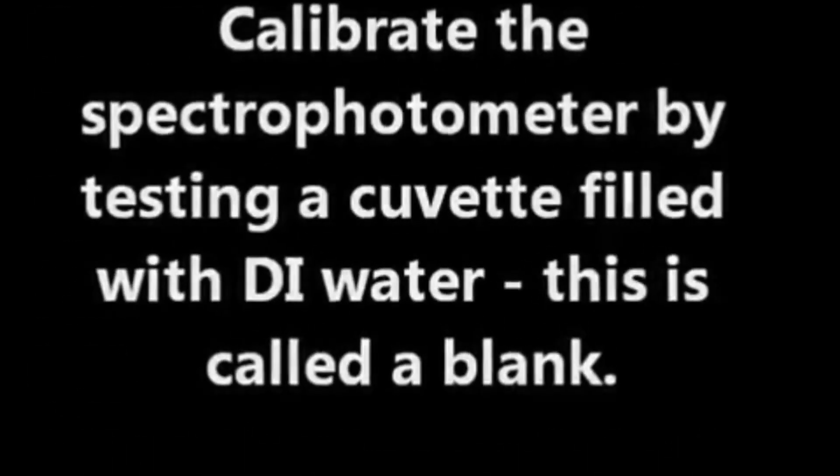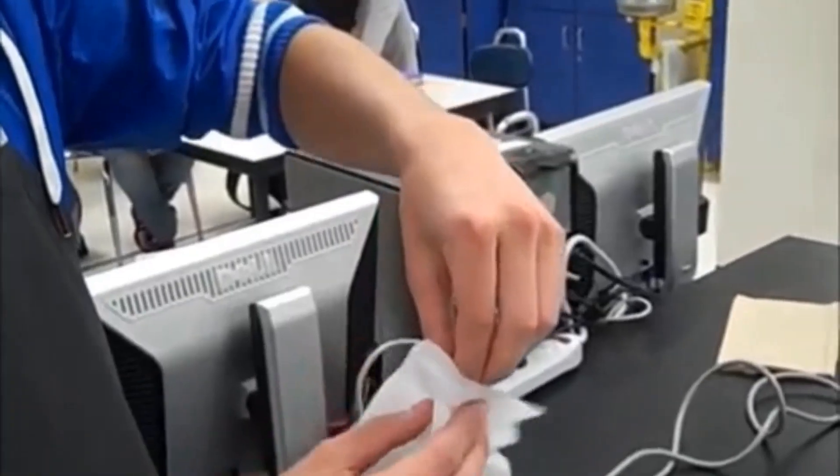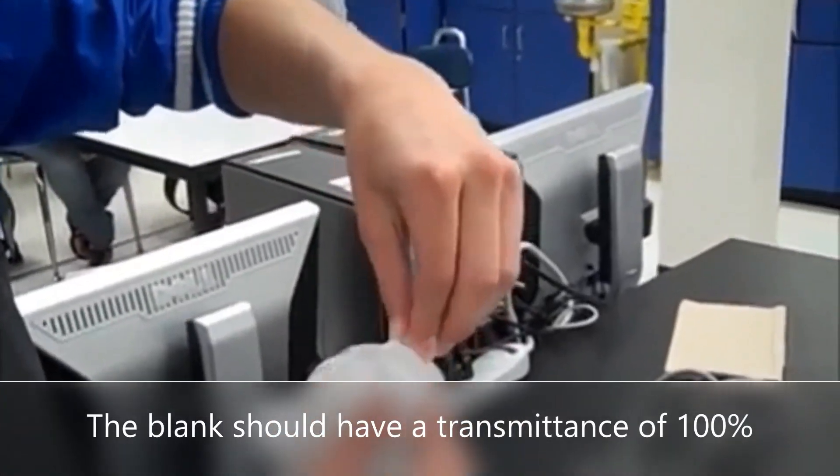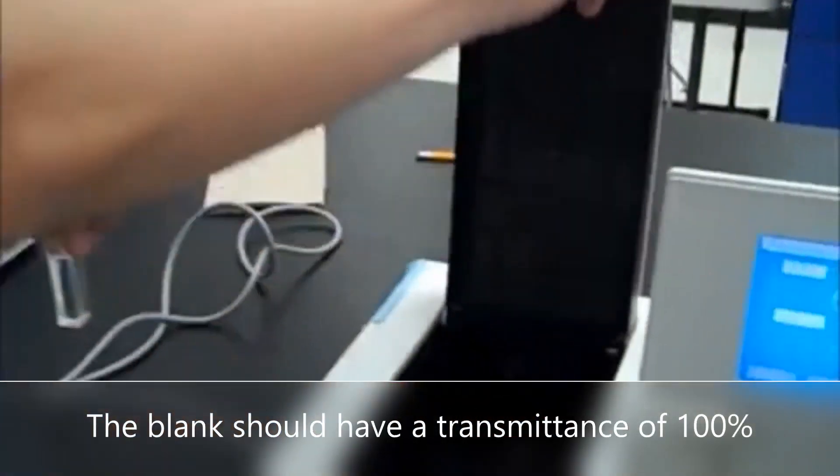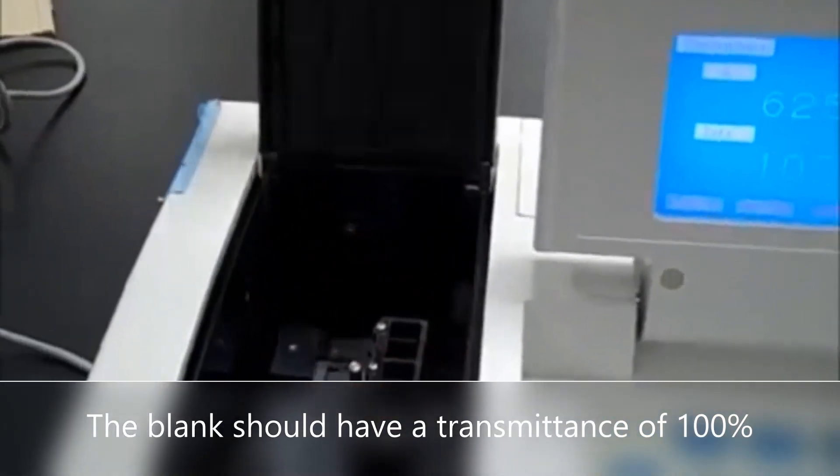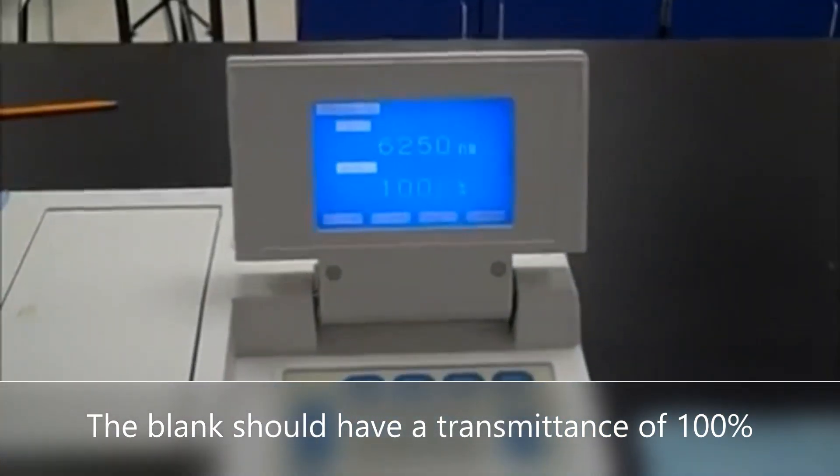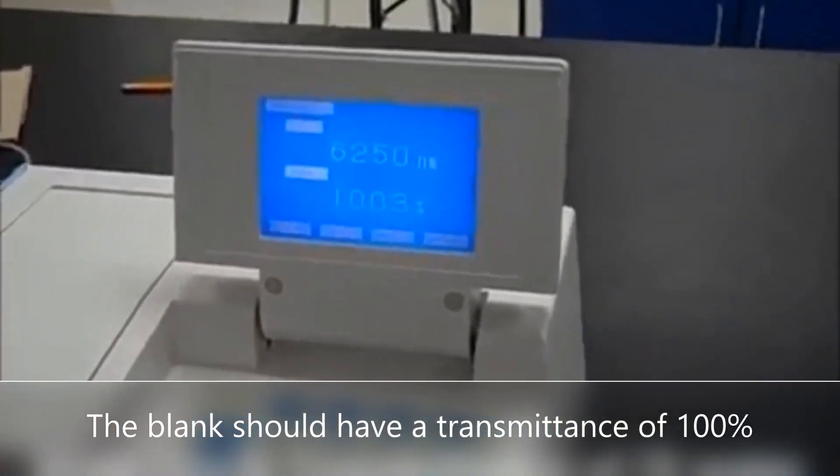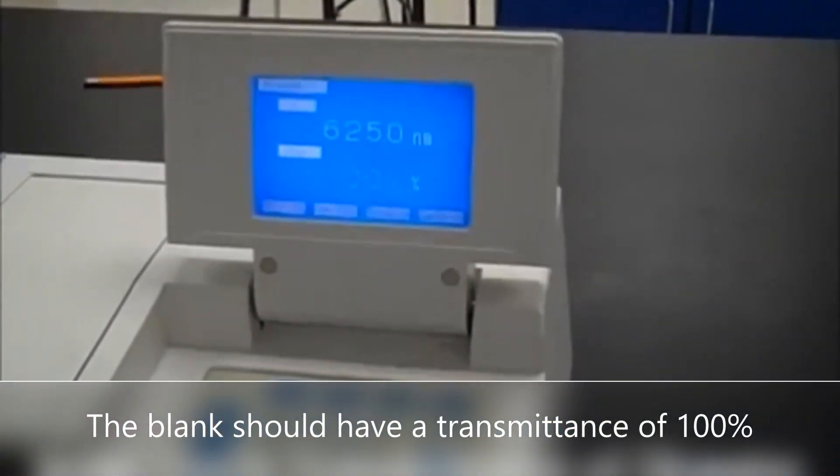The spectrophotometer is calibrated using a blank. This is a cuvette filled with pure water. The blank should have a transmittance of 100 percent because it doesn't contain any of the compound which will absorb any of the light. For this experiment the light is set at a wavelength of 625 nanometers.